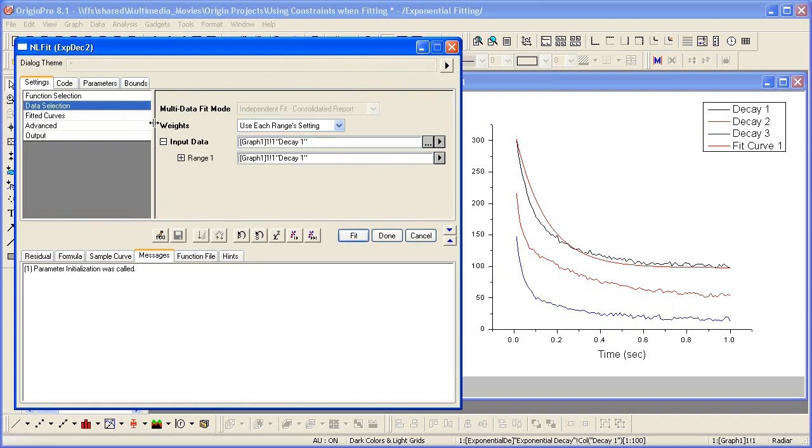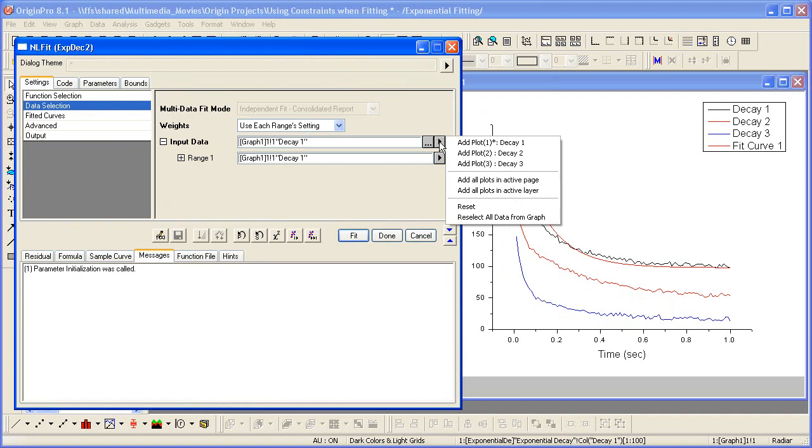For input, Origin automatically assigned the active data plot. Clicking the arrow next to the input data, I can add all the plots in my graph window.